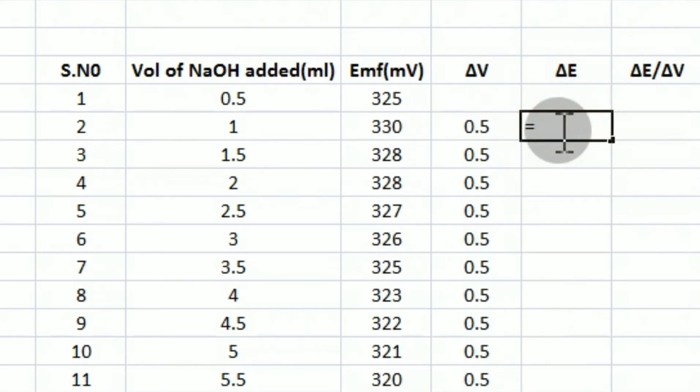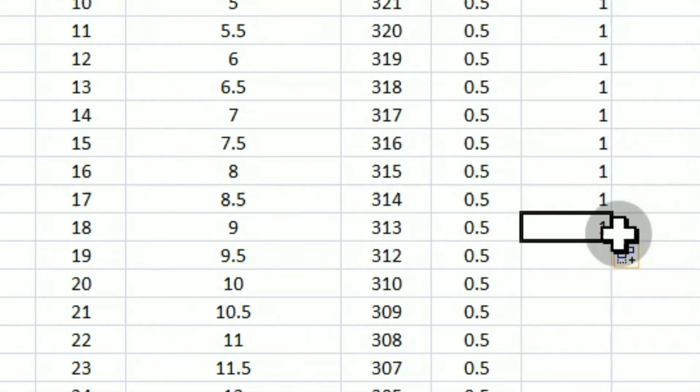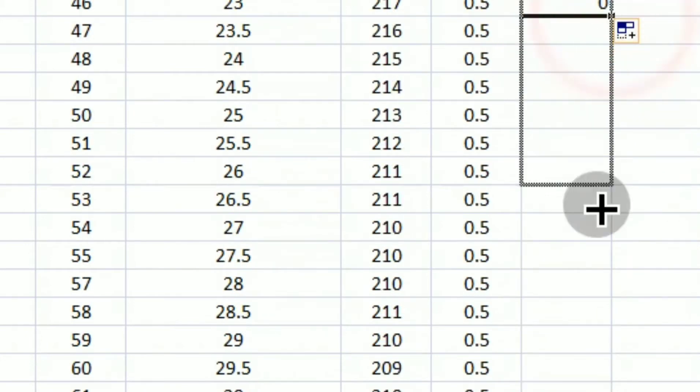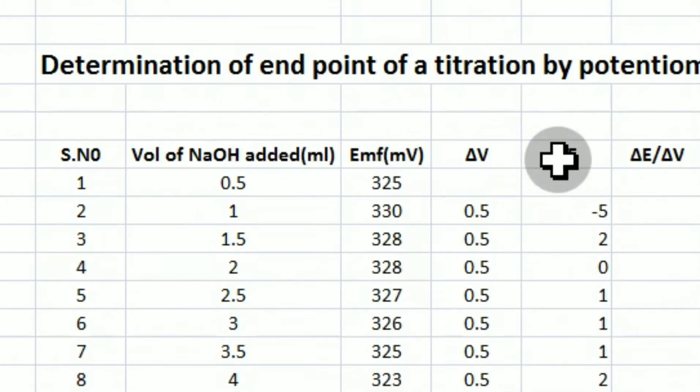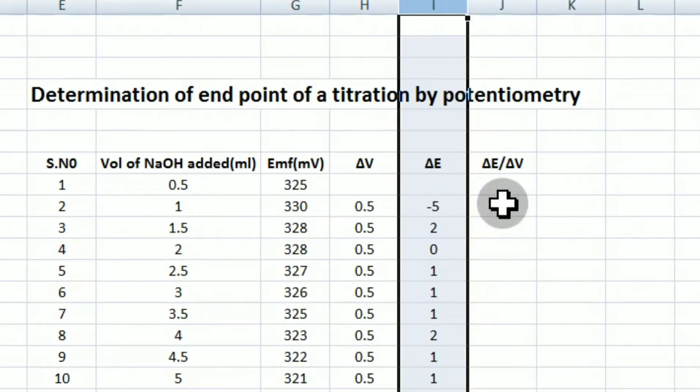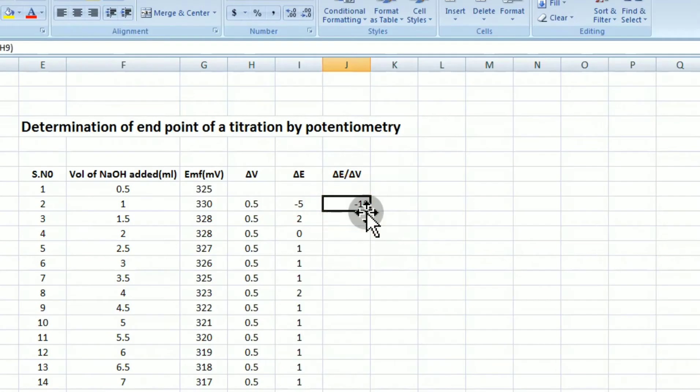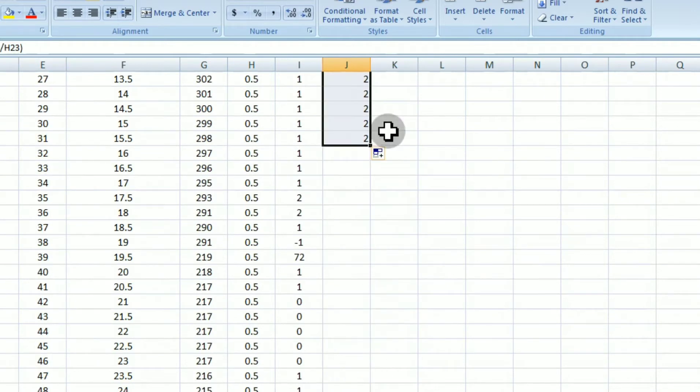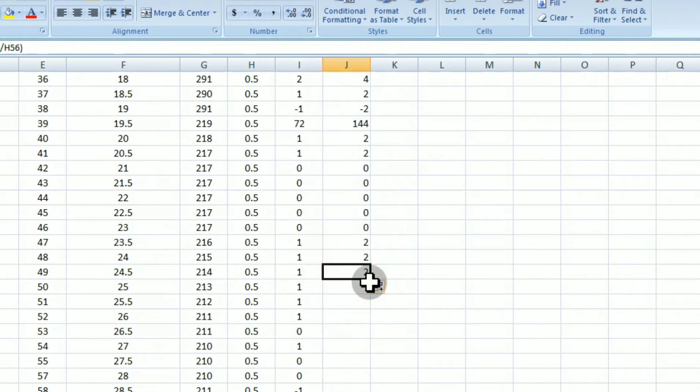And also you have to calculate the delta E values. That is the difference in the potentials, difference in successive potentials. And these values can be simply obtained by applying the Excel formulas. And next you have to calculate the delta E by delta V values. So like this, you have calculated all the required values like delta V, delta E and delta E by delta V.